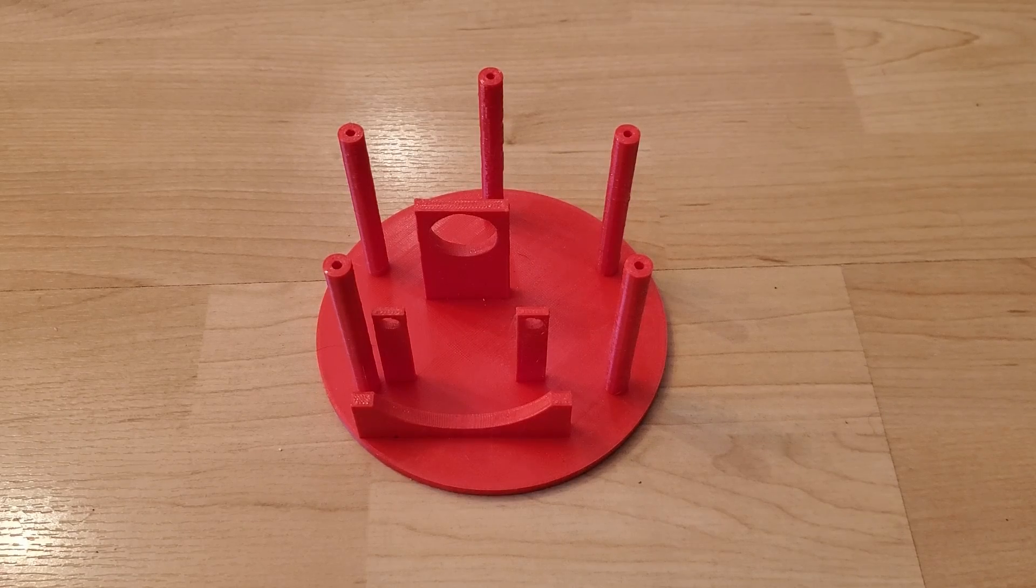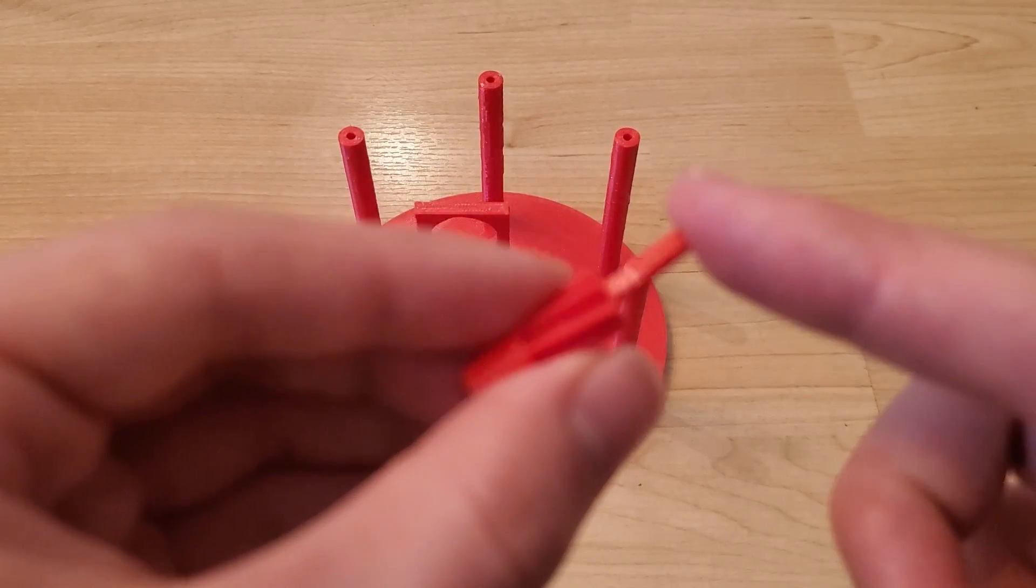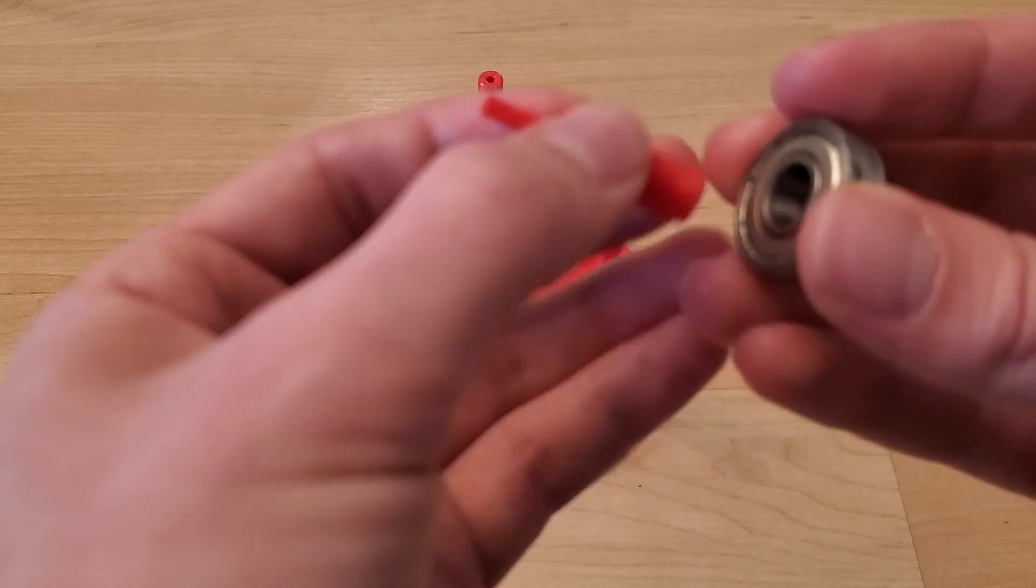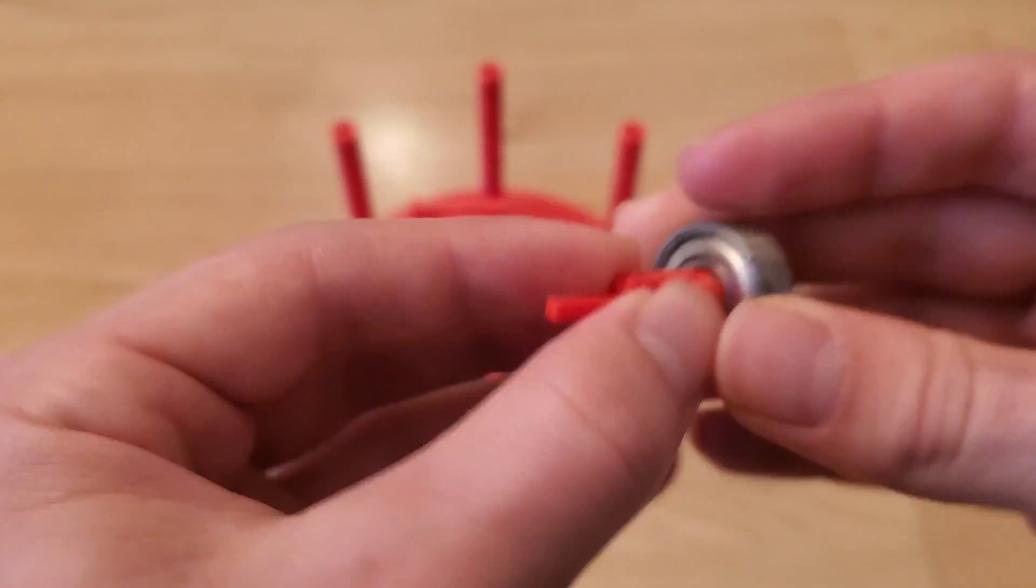The assembly of the centrifuge is also quite simple. First the square drive and gear are hammered together. Once you've completed that you can attach it into the bearing.